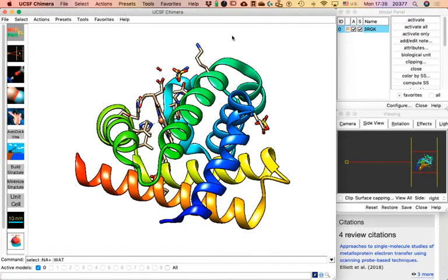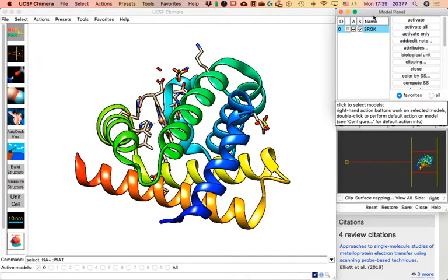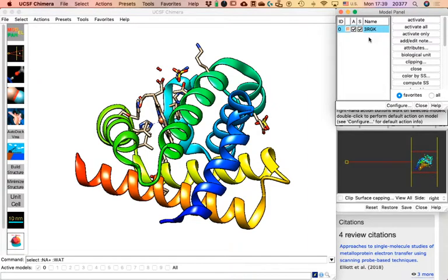The Model Panel is the most useful for me because if you're going to visualize more than one structure, here is where you get a list of them. Here we have only one — 3RGK, the myoglobin — and you can perform several actions using these menus.